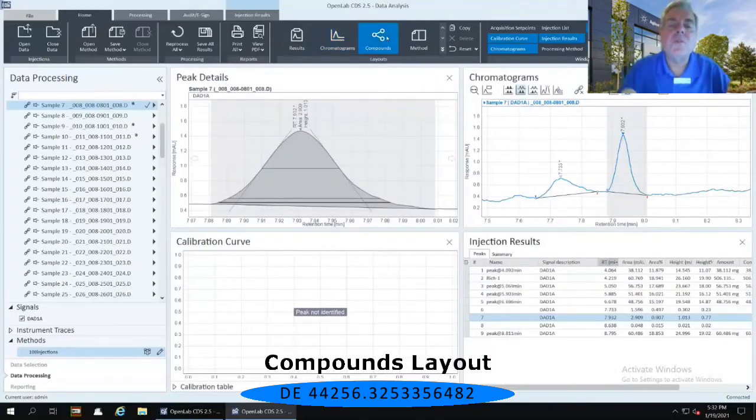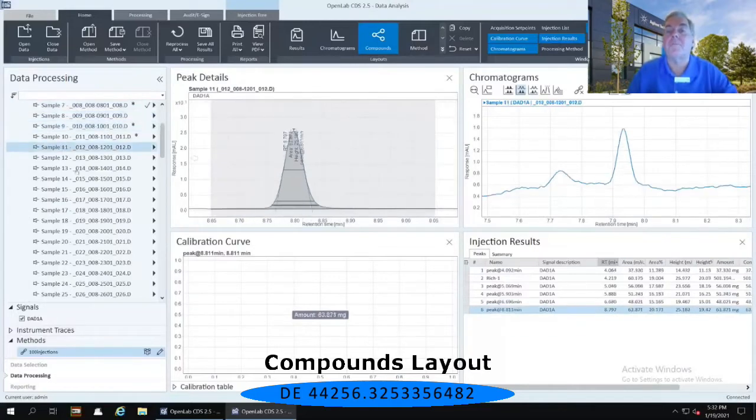chromatograms moves in its geographic location on the screen, but it maintains the integrity of that blown up chromatogram, that blown up section of the chromatogram. This is something that the users of some of our older software, such as ChemStation and EasyChrome, have been clamoring for years to try to be able to get. That when you're going from one view to another, or even if you go from one injection to another on the left-hand side, you'll notice that that chromatographic window stays blown up to the point of where you had blown it up in the previous exercise.